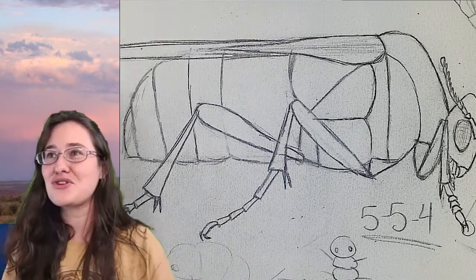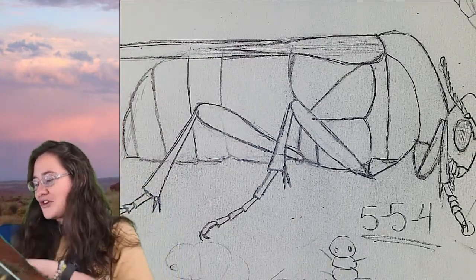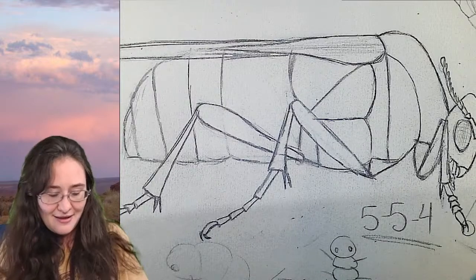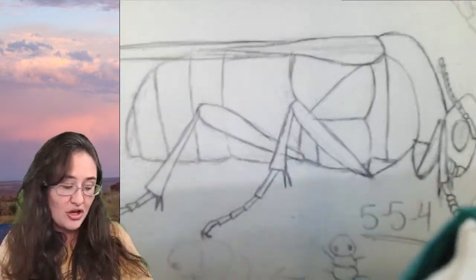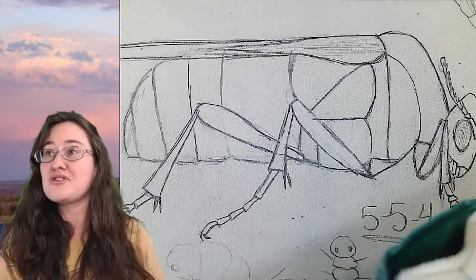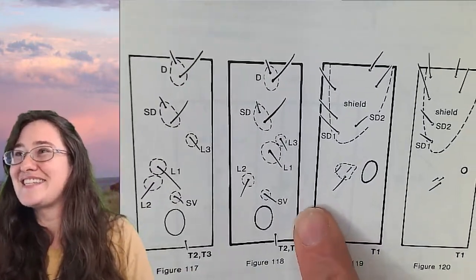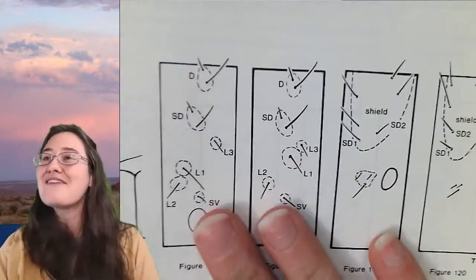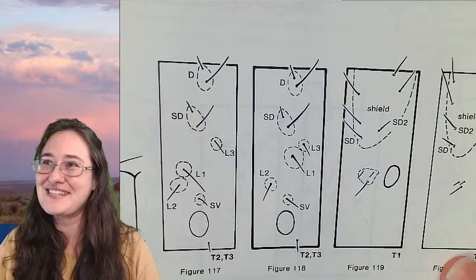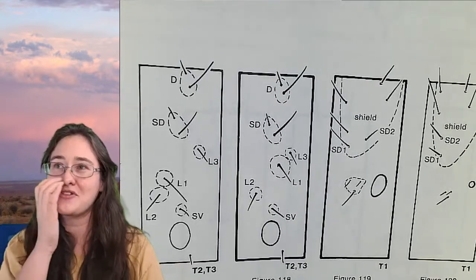Because I don't know if I've ever shown you these. When you're identifying caterpillars, there's a handful of characteristics you're looking at. You look at the crochets, which are the little hooks on the bottom of their feet. You look at their eye formations, because caterpillars have unique, simple eye formations. And then you look at their hairs. Every single hair on a caterpillar is named and numbered. And this is how you identify caterpillars down to family and then likely down to species too. I've mostly just identified caterpillars to family.